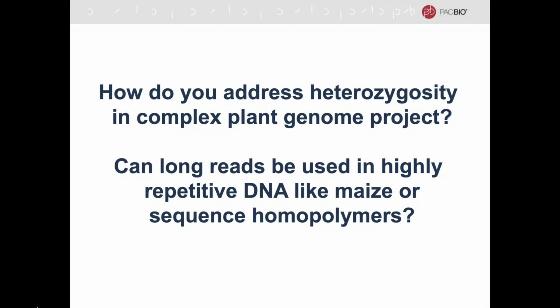Sure. So for octoploid strawberry, when we just put in the data and don't try to do anything particularly to parse out haplotype phases upstream of the assembly process, usually our assembled genome size is about 160% of the haploid genome size. Not only is our species octoploid, but the subgenomes themselves are very heterozygous. So we know we're separating those haplotypes and getting two contigs for a lot of haplotypes in the genome.